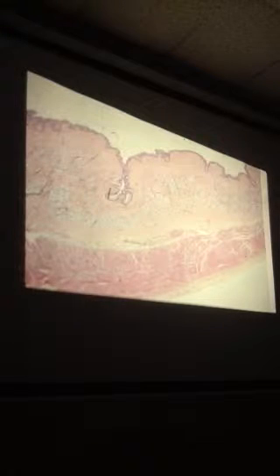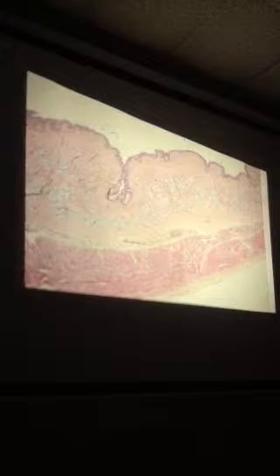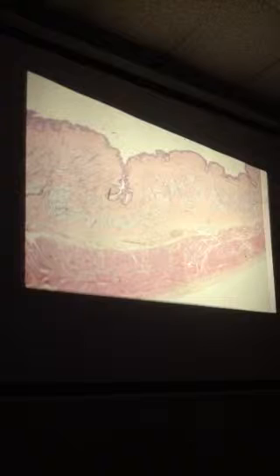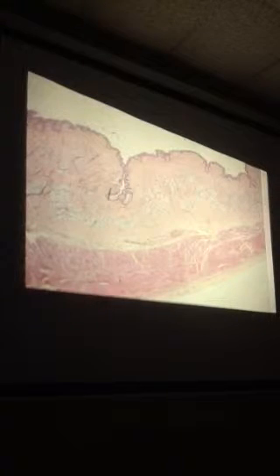Then it gets very dense and dark. The third layer we often call the peristaltic layer, the muscularis externa. Be aware that there are 2 grains to this layer. Inner circular runs around the lumen. As you move out, it shifts 90 degrees to go longitudinal, which is this layer.